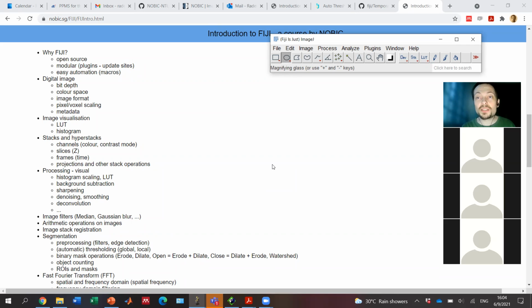And of course, the other thing is that you might realize that there are so many plugins, and for typical tasks like localization analysis, which a lot of people do, you will find that there are plenty of plugins which do about the same. So the typical joke of coding applies here: why does no one use my code? Because everyone is busy developing their own.